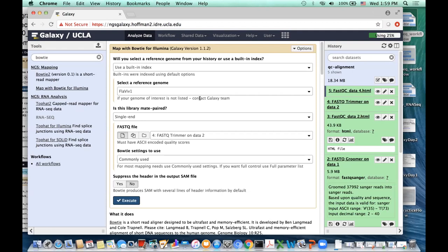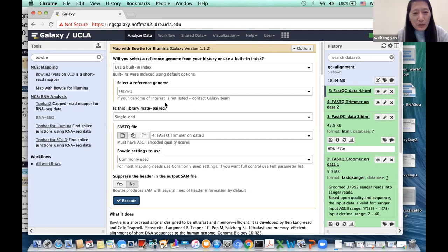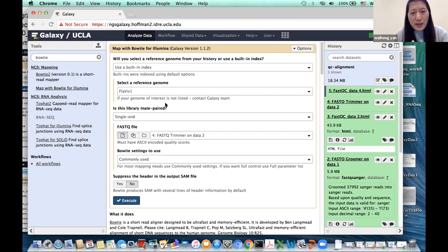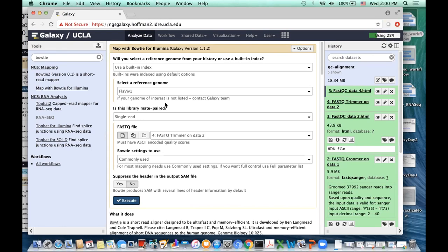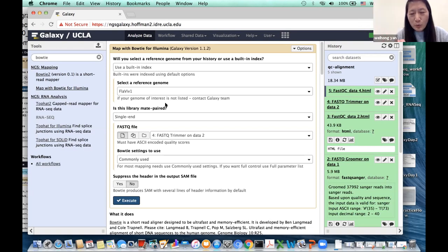For our case I'll use the trimmed data to show you how to use this step by step. We are going to build a workflow. Once we have a workflow, we don't need to repeat steps one by one — all we need to do is submit the workflow and it will take care of everything for us.